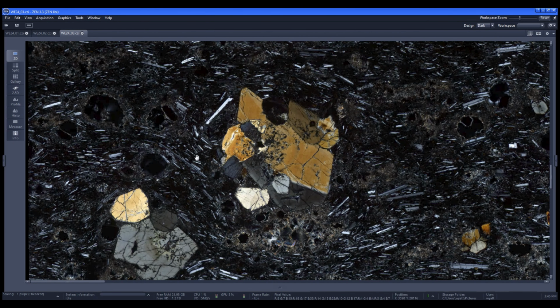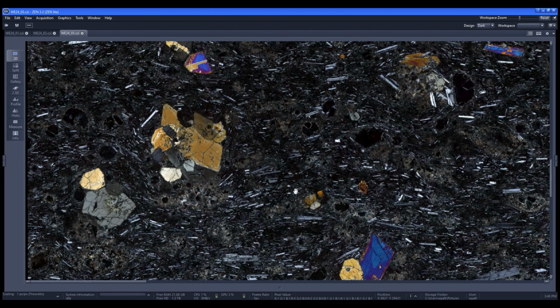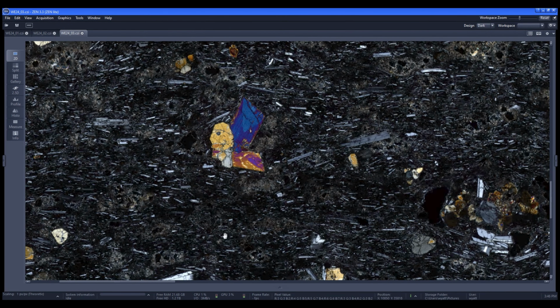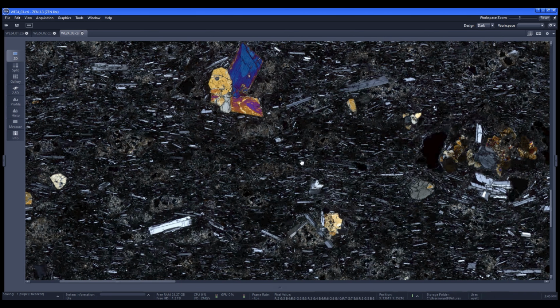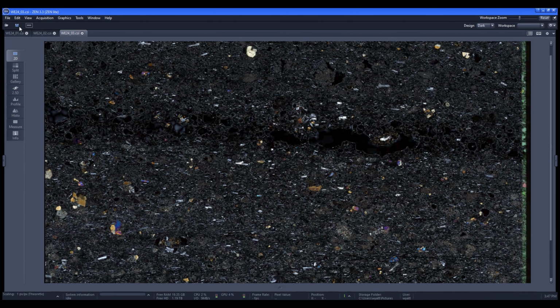And you can see kind of how the flow texture in this bomb kind of wrapped itself around this grain, maybe as it was kind of rotating in the mush as this bomb was cooling down. Or maybe this all occurred while it was flying through the air, because as it's flying through the air, it's cooling, but it's also molten, so the air rushing around the bomb can actually shape it, and a lot of them will take on a bomb or missile-like shape to it. It's interesting. Some of them look like little mini footballs almost. So let's move on to another sample.